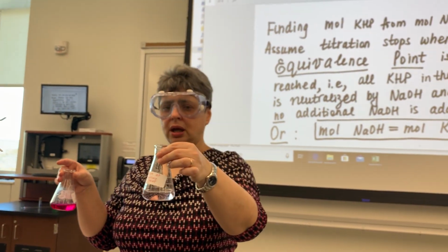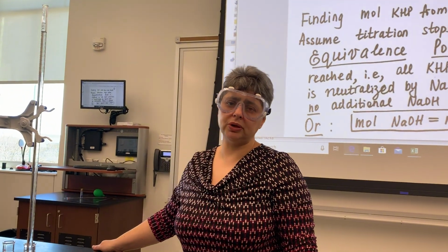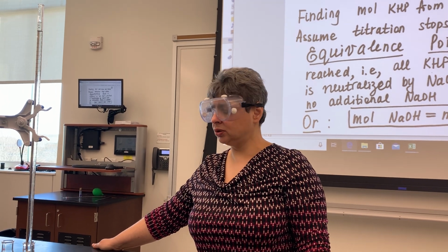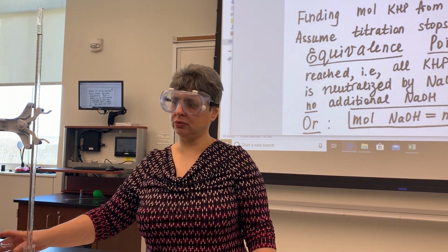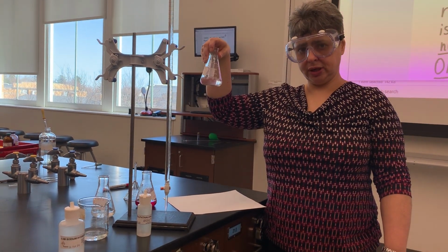Once again, you can expect to get an email from your TA where data for the titration will be provided. You will be given the mass of KHP used for titration, and the volume of sodium hydroxide used to get to the equivalence point.